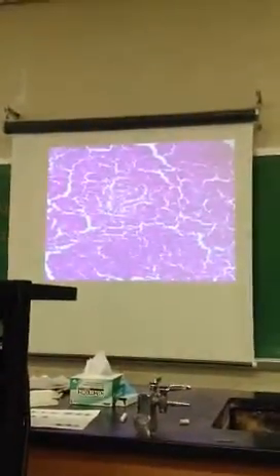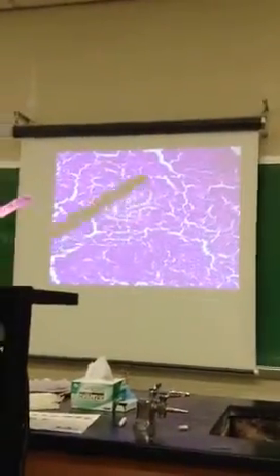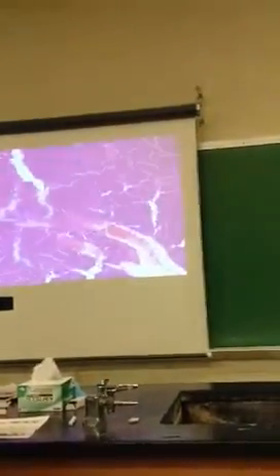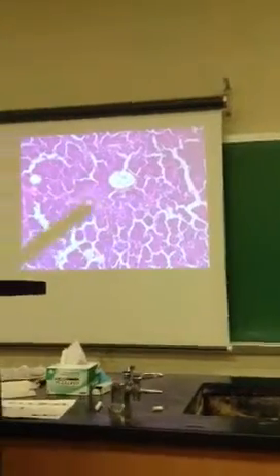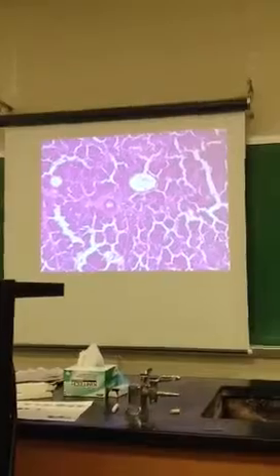So like this one here, yeah, the islet. So islet, very different looking than the rest of the surrounding tissue, which is the pancreatic acini. And then we have the pancreatic duct over here. Okay, we'll go with this little one for right now. But any circle of cells in that particular organ, that's the pancreatic duct.